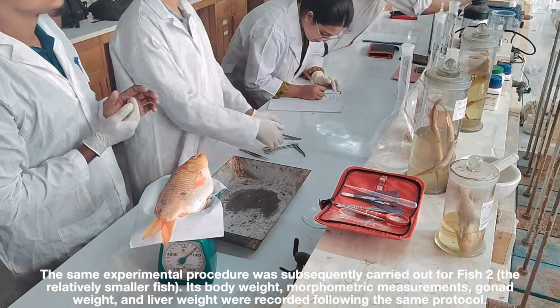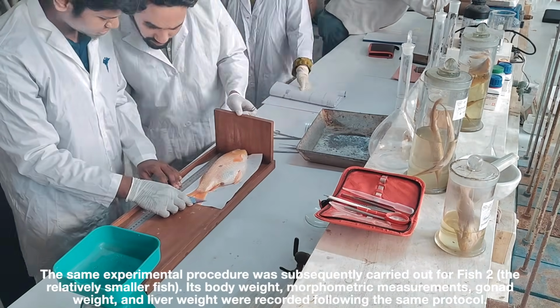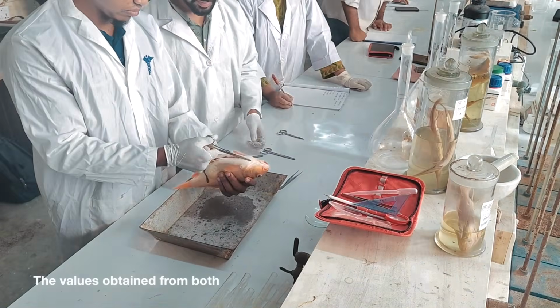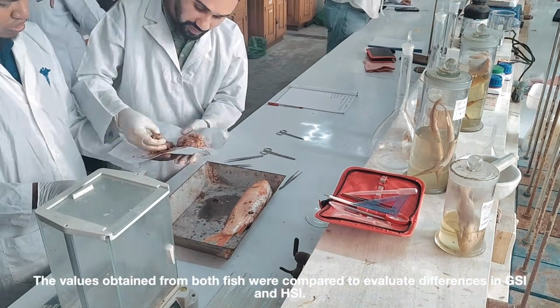The same experimental procedure was subsequently carried out for fish 2, the relatively smaller fish. Its body weight, morphometric measurements, gonad weight, and liver weight were recorded following the same protocol. The values obtained from both fish were subsequently compared to evaluate the difference in their GSI and HSI.